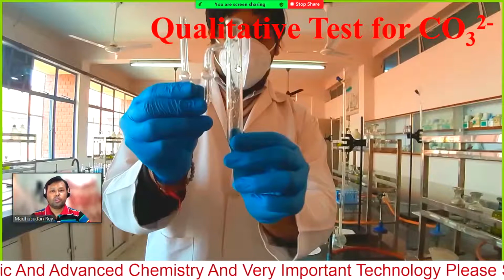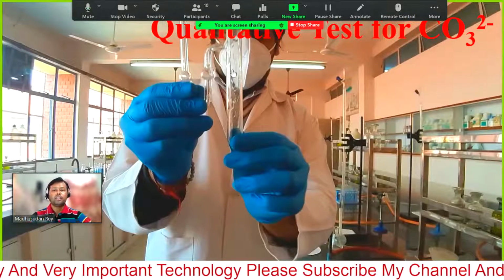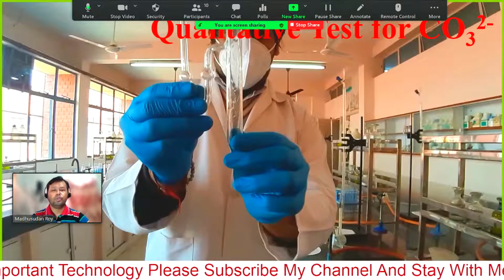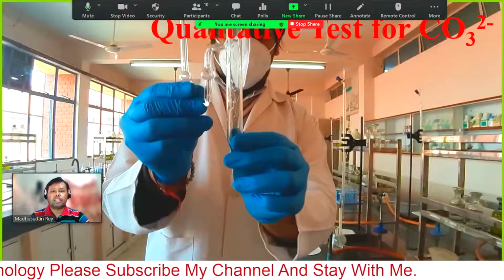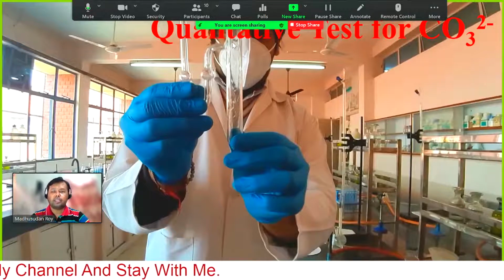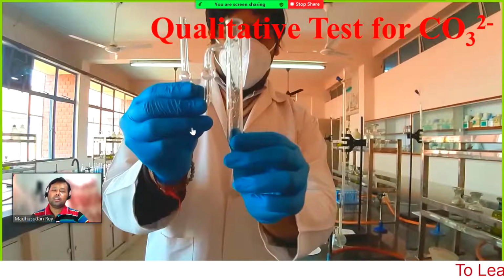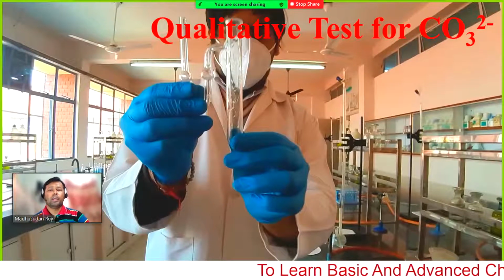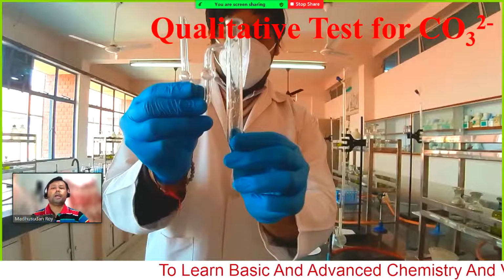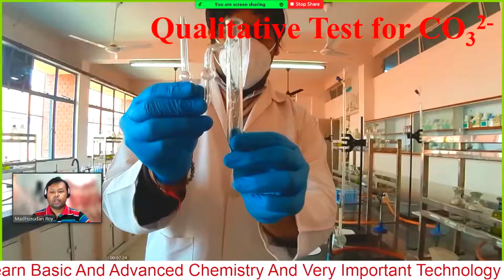What we have used is just a bent tube here, like an inverted U tube, and we have attached the tube to the mouth of the test tube, and then put the lime water inside another test tube. That is also fine, but I think this one is even better. If you use these types of instruments, you can get better observation compared to what we have used. Anyway, so let's see.